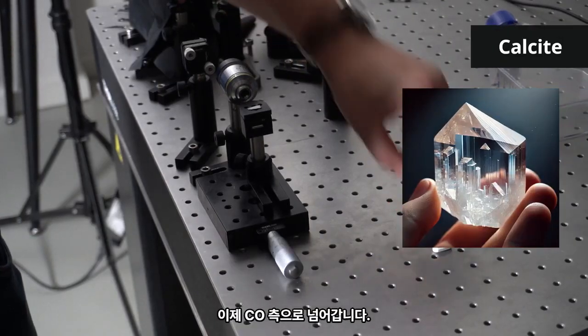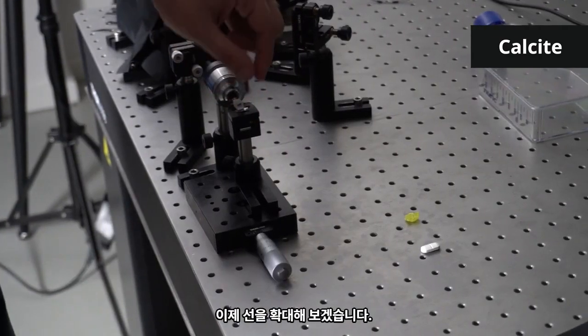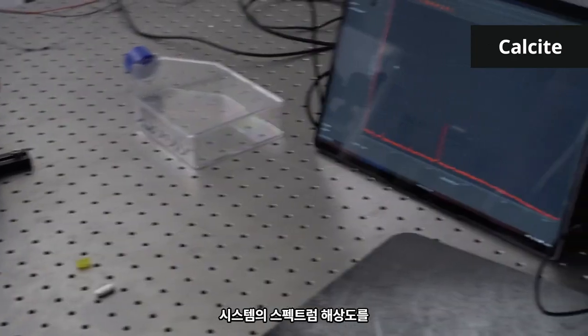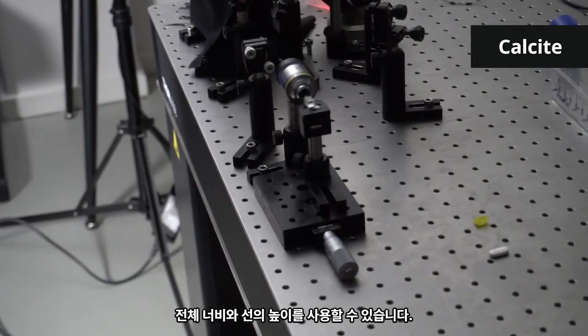Now we move on to calcite. Here's the 1085 wave numbers line of calcite. Now let's zoom in on the line. We can use full width half height of the line to estimate the spectral resolution of the system as 5 inverse centimeters according to the ASTM standard.